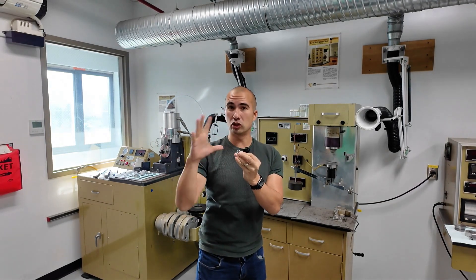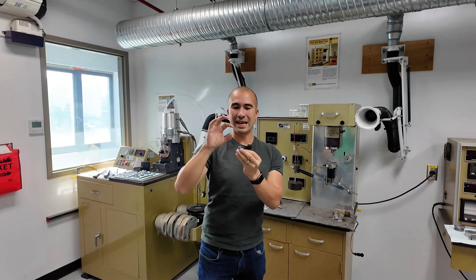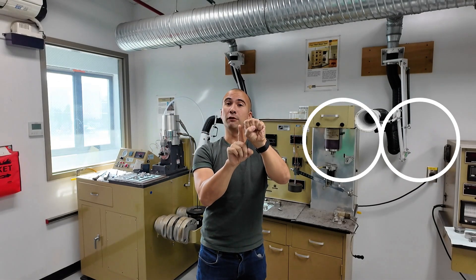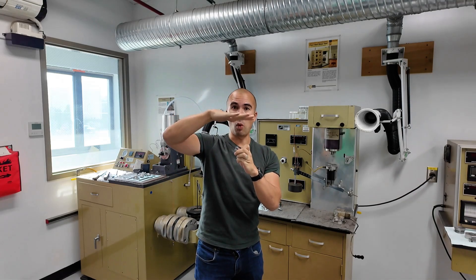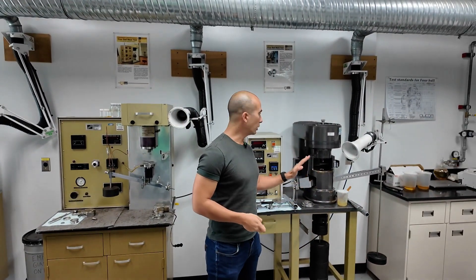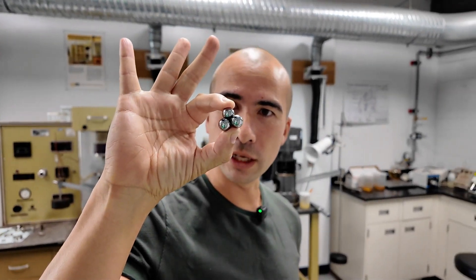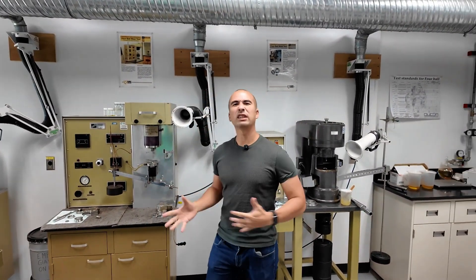This system is an extreme scenario when you consider lubricated conditions. How does a ball contact the other three balls? In each instance, it's a point load. Theoretically, how does a sphere touch another sphere? It does it at an infinitesimally small point, and we do this three times. We're rotating the top ball relative to the others while placing a load generated by these weights. In one instance we are looking for a wear scar under controlled conditions, and in this instance what we're looking at is the weld load. You can actually see that the balls have welded together — this is something that would happen with metal-on-metal action, and what this is really testing for is the EP qualities of the oil.